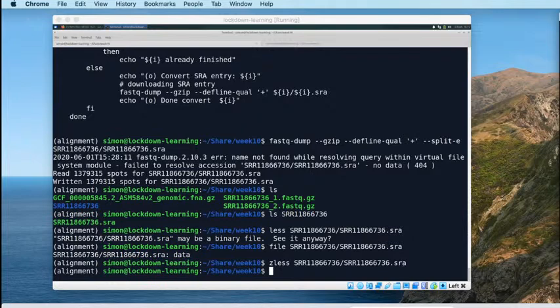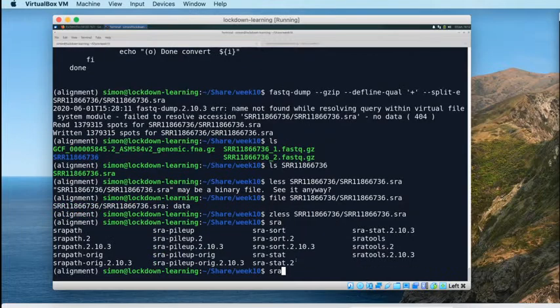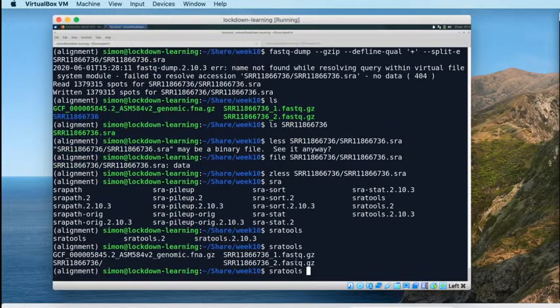I'm sure that we can get the SRA format out of it if we want to. I would imagine that there is an SRA tool for doing it as well. SRA tools. Is there a view? I don't know. I'm going to have to row back on this. Maybe I'll do this another time. It was a nice idea, but let's do this another time.